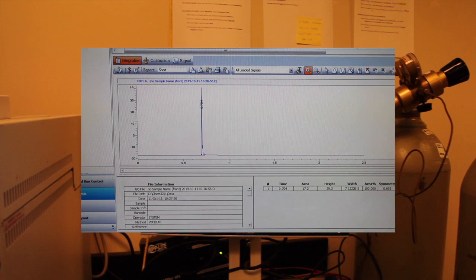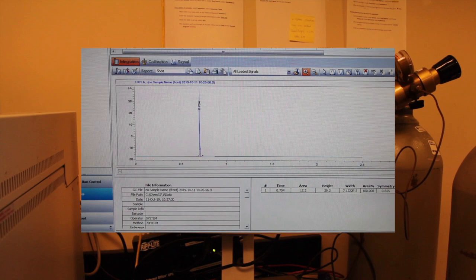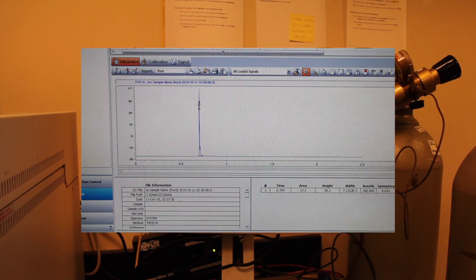In many cases, you will see evidence of both components of your original mixture being present in your distillate. The ratios of these two components will provide insight into the efficiency of the distillation as a means of separating the two compounds in your unknown. Be sure to obtain the retention time and an integration of the area under each peak. These areas will allow you to determine the relative amount of each compound present in your samples.